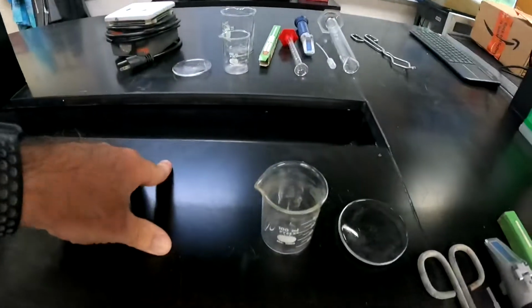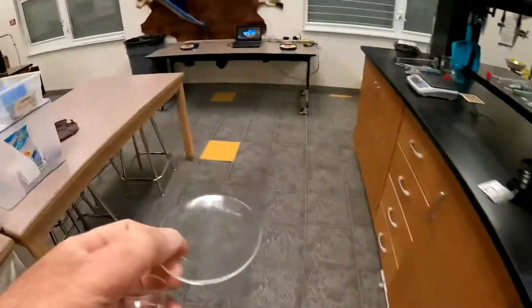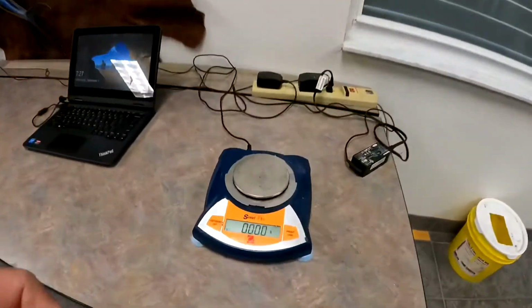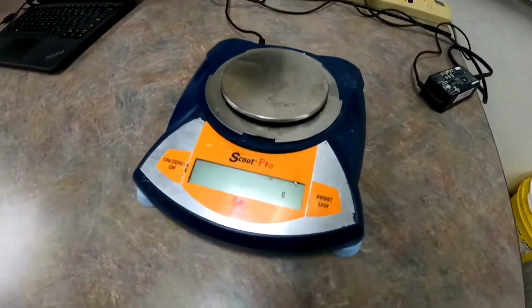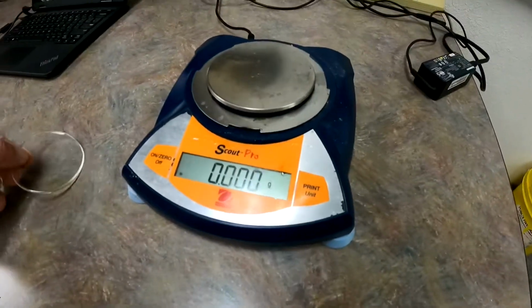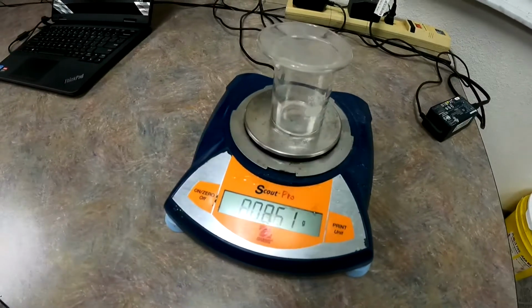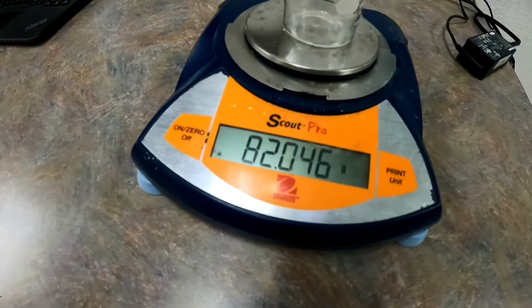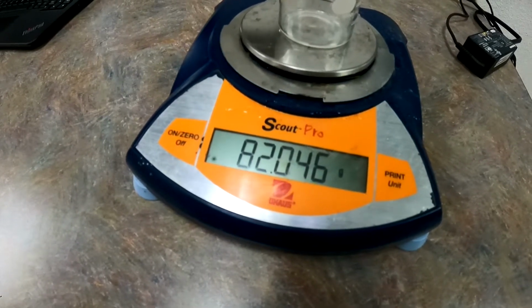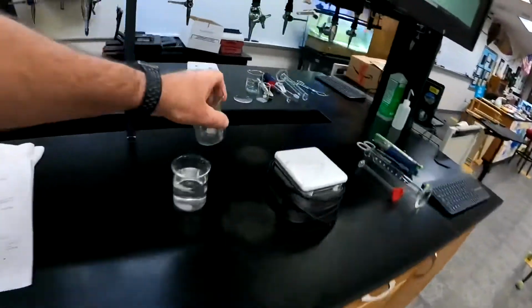After that we need to measure the mass of both the 100 milliliter beaker and this watch glass. So we'll take this over to the digital scale and we will zero it. Tap that, see it blinking there, and then we'll determine the mass of these two together and make sure we write it down to 3 decimal places. That's pretty good there.